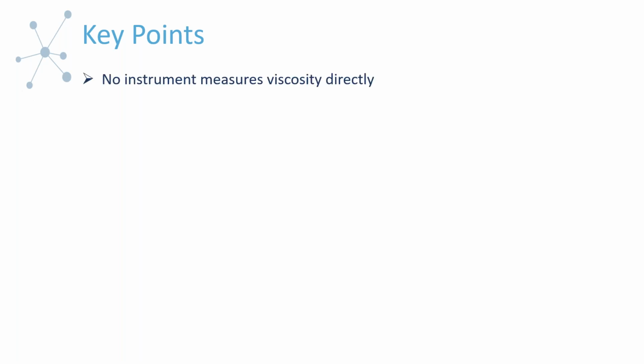One of the things I wanted to point out is that viscosity is never directly measured. It's not a directly measured property, and there's no instrumentation that does this. This was one of the misconceptions we recently experienced when dealing with a customer. When I say it's not directly measured, what I mean is that it's a calculated property. As you'll see as we go through the webinar, how we define viscosity and how this calculation process proceeds.